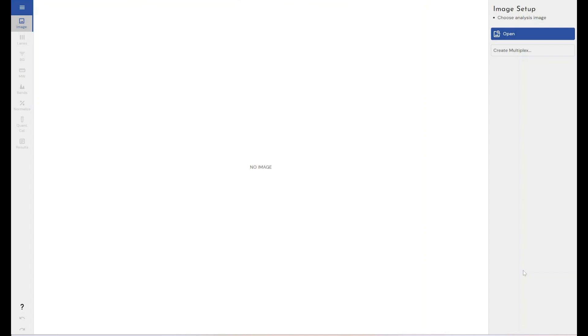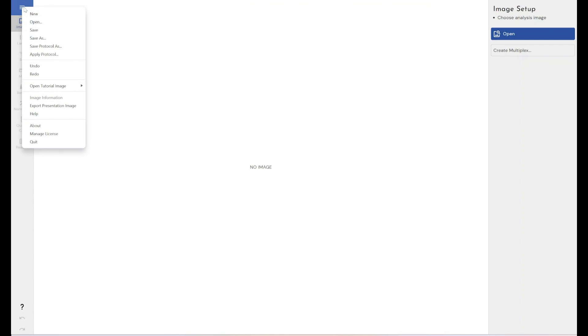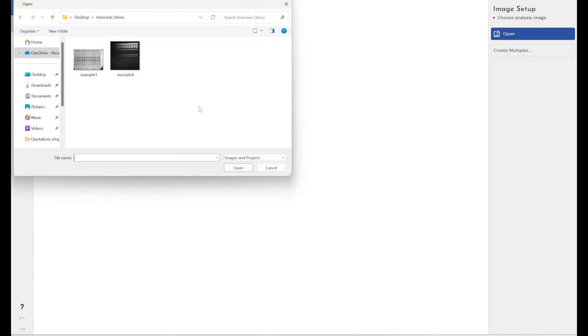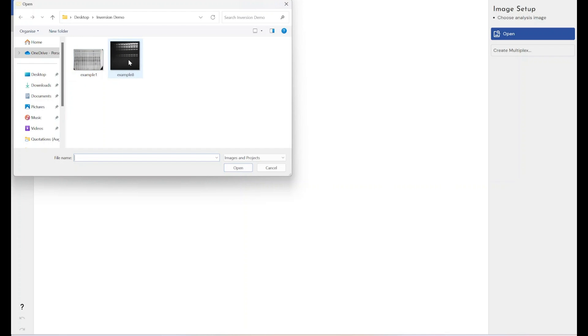I'm going to do this with an example. So I'm going to grab two images here, one where the bands are white and one where the bands are black to cover everyone's use case. Within Windows I've got my two images: one is a white background with black bands and the other is the inverse, white bands on a black background.